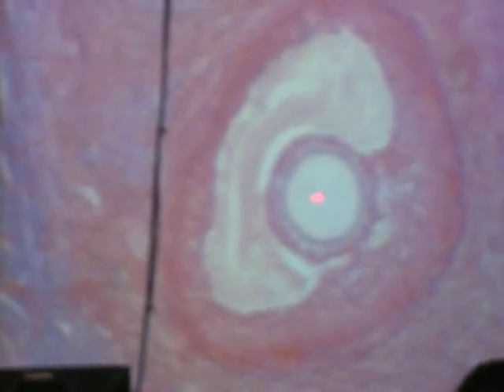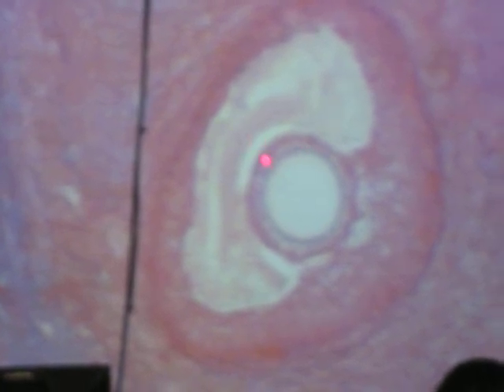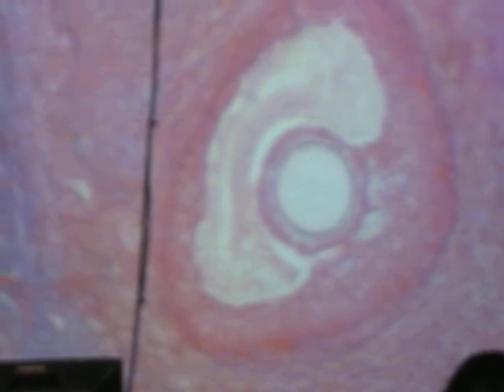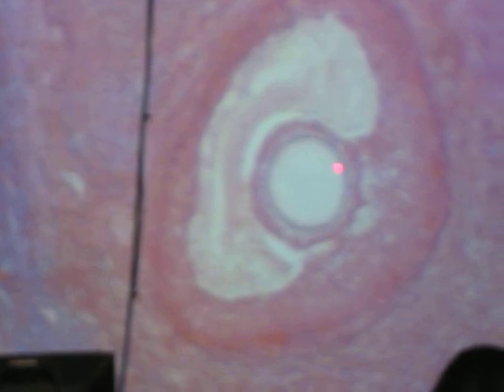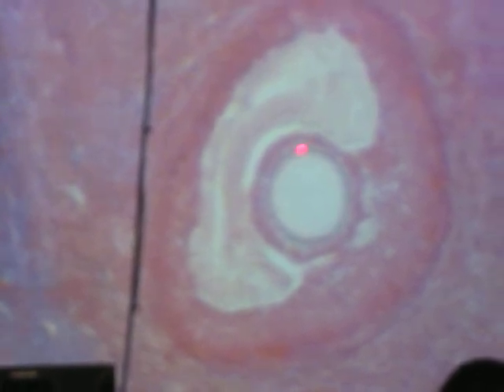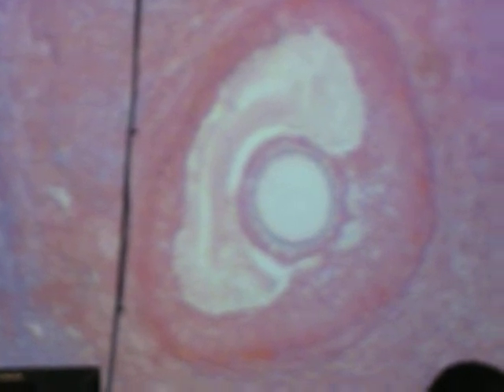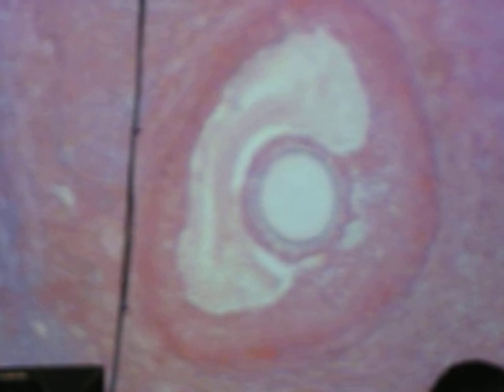This is now a secondary oocyte inside, and you can identify the small little group of cells around the secondary oocyte is called your corona radiata. And then see the thick line that lines, that's your zona pellucida. That little structure there, that little thick line. These are some parts that you should be able to identify on the mature Graafian follicle.